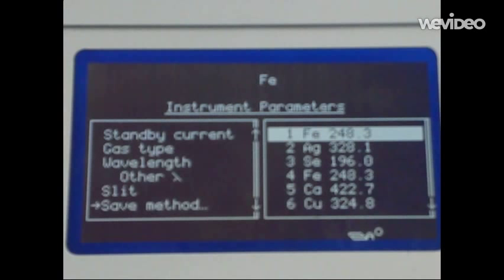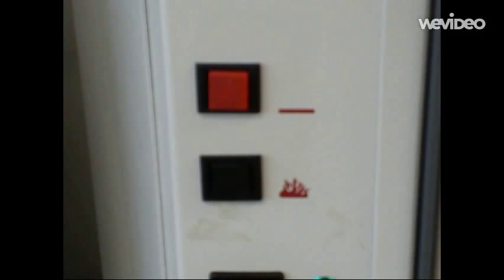Using the control panel, the cookbook option is selected, followed by the load method, and the metal of interest is then chosen. The red button on the top left is pressed to reset the instrument, followed by the black button being pressed in order to light the pilot.